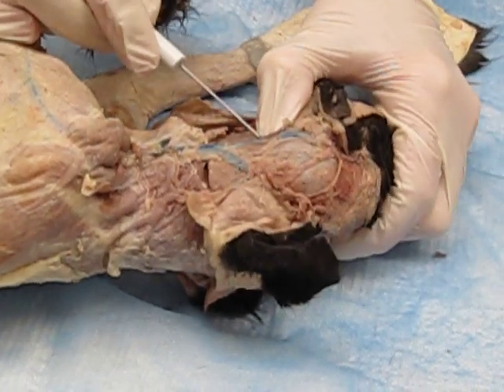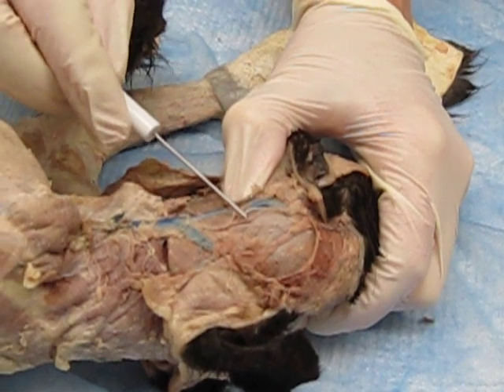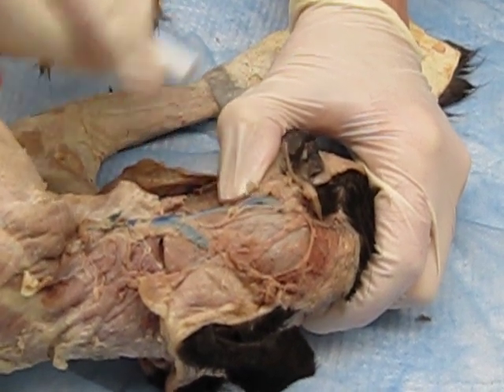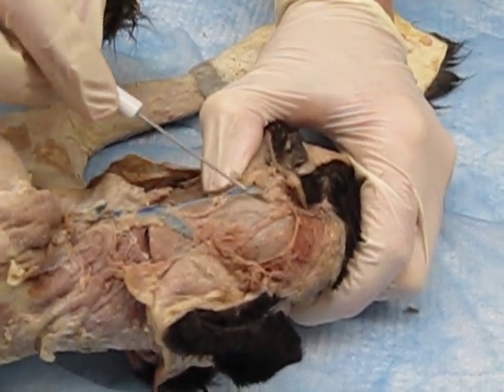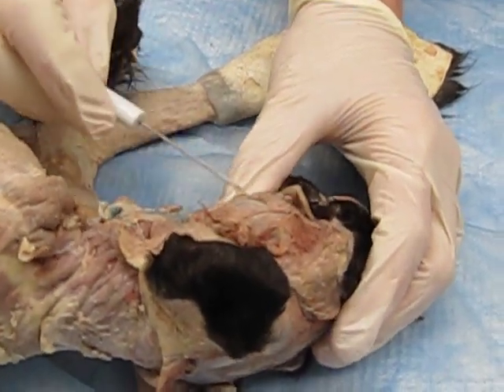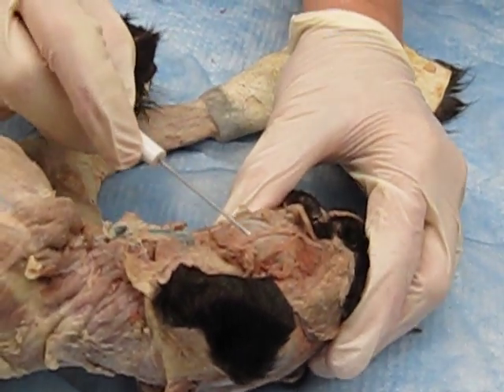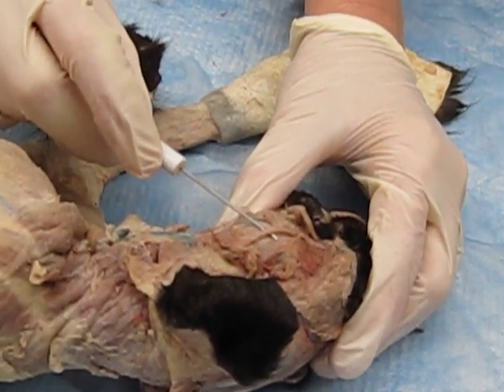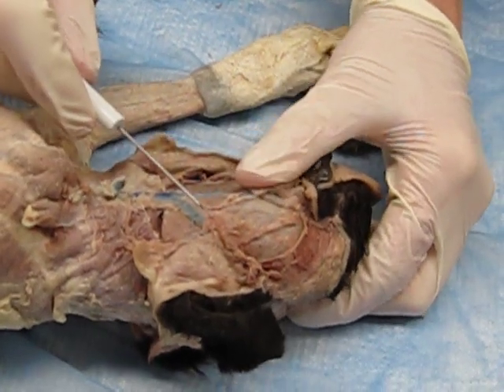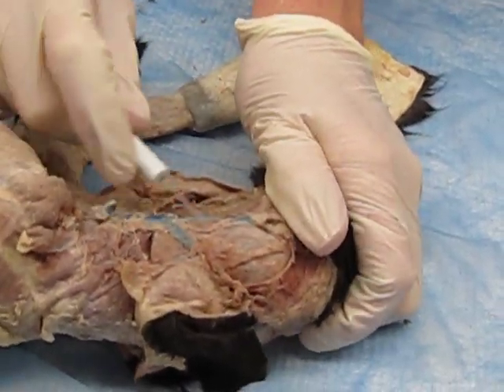So saliva is then distributed into the mouth from that parotid salivary gland. Okay? There are also some other little nerves down here, but we don't have to know them. But it's good because it helps you reference where you're at, because those nerves are also on your sheet here. We just don't need to know them. Okay? So I want you to start here, to gently dissect and find the facial nerve and the parotid duct. Okay? From there, I want you to locate the rest of the glands that are in the neck area.